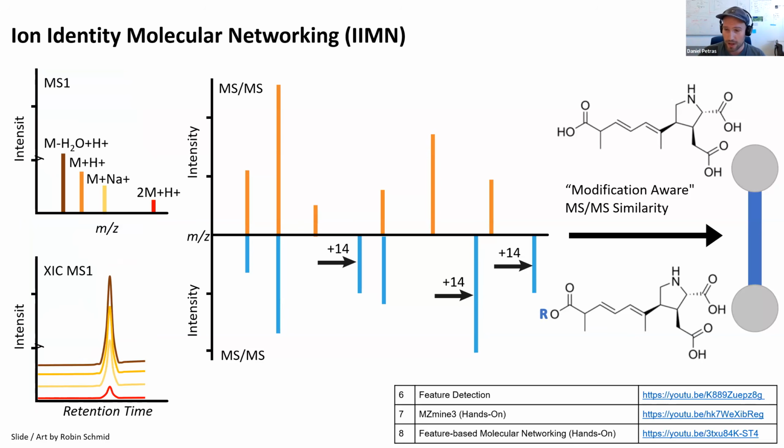And as I mentioned, this was talked about extensively, both by Tomasz Pluskal as well as Robin Schmidt, who actually programmed most of the ion identity and now also MZ-Mine part. With a great hands-on tutorial about MZ-Mine 3. So please check this out if that sounds interesting to you.